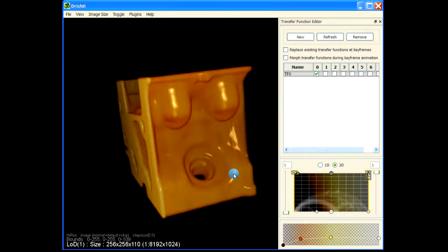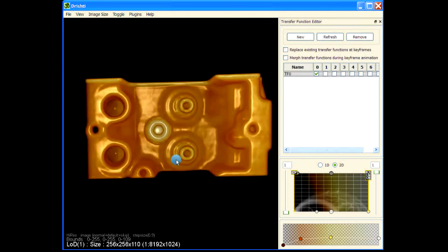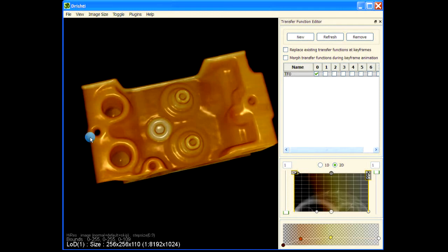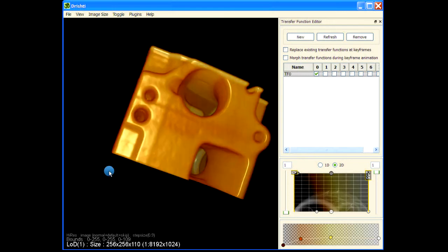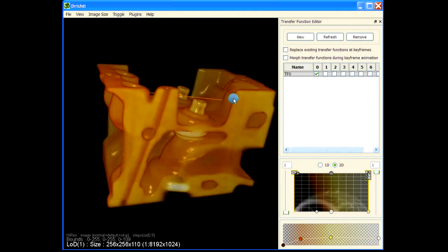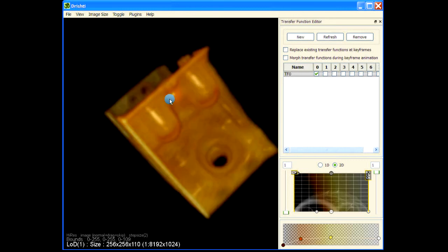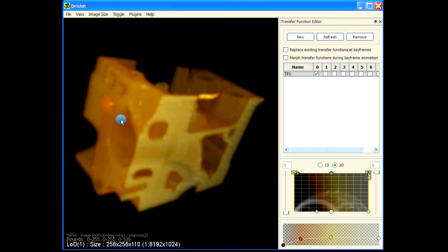This video will show you how to generate profile information. Let's put some points here. Let's generate basically a path. Suppose we want to get a profile from that point here to this point. Add path. So I've added 2 points here, point 1 here and point 2 here, using shift left click, and I would like to get profile curves along this path here.